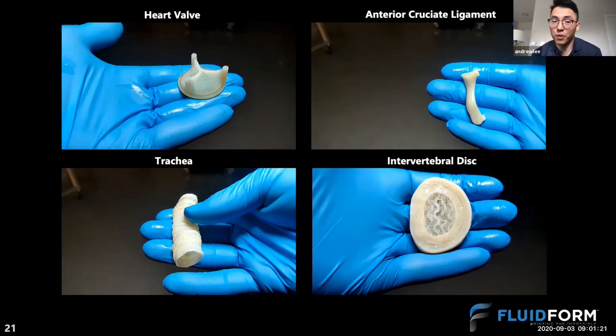It's definitely interesting to us. There are also a lot of post modifications to the prints that can be made in terms of cross-linking, where you can add chemicals such as glutaraldehyde to treat these. And so those are some of the next steps that we're interested in taking.